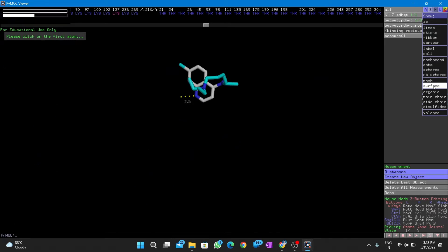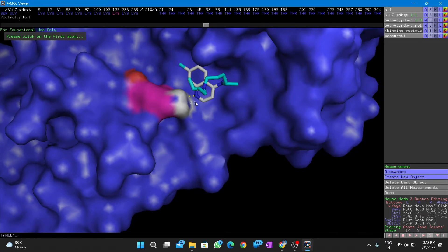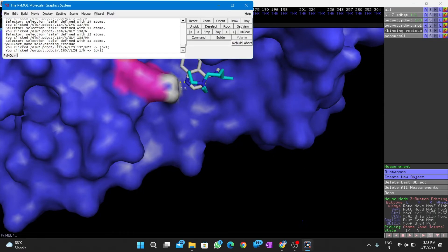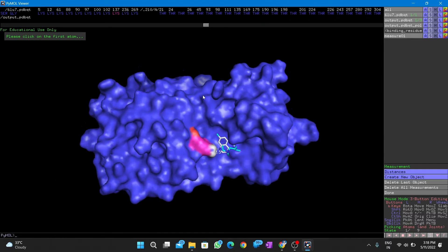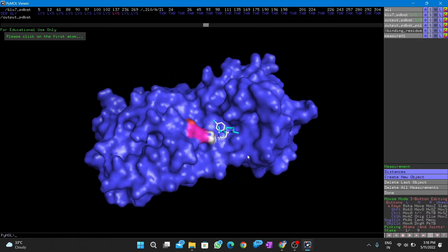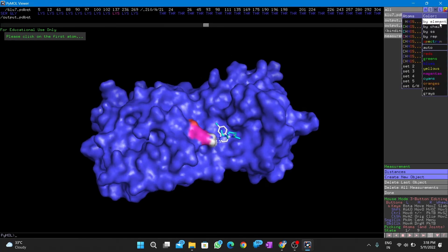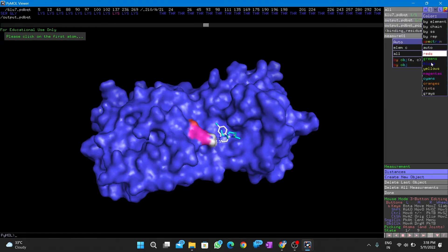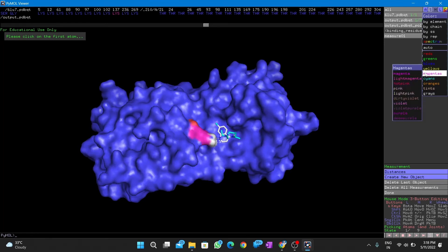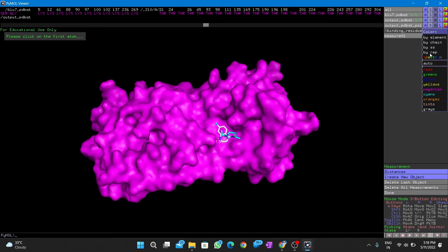Looks cool. See the binding pocket is pink in appearance. Change the background colors if necessary.